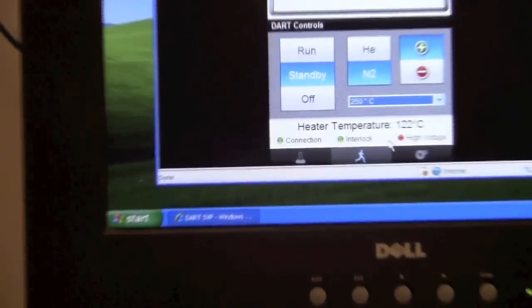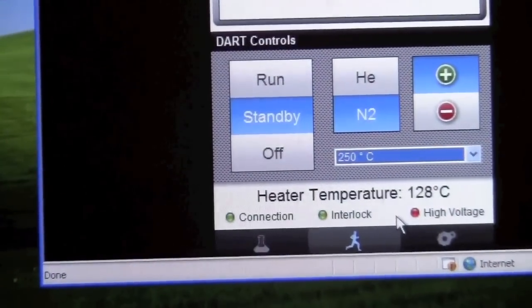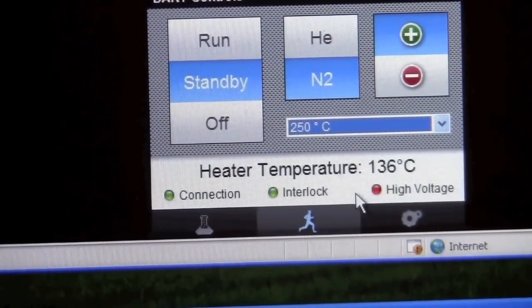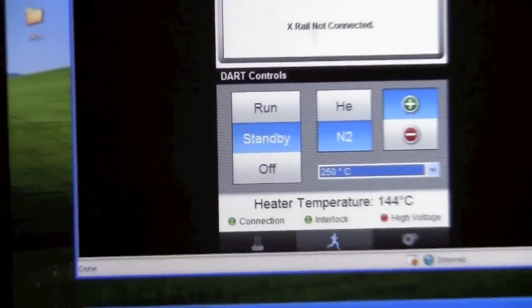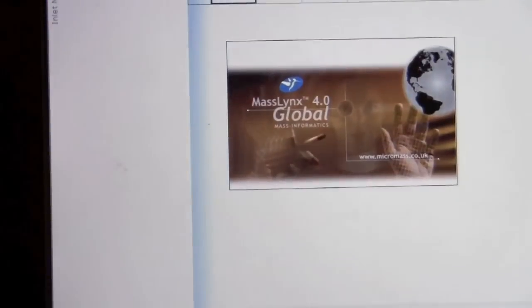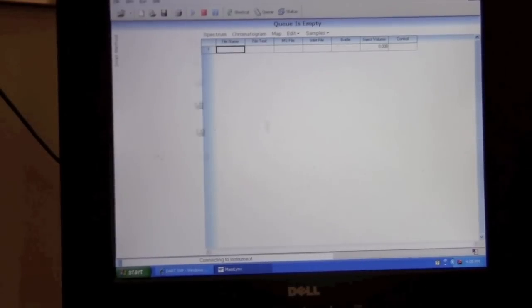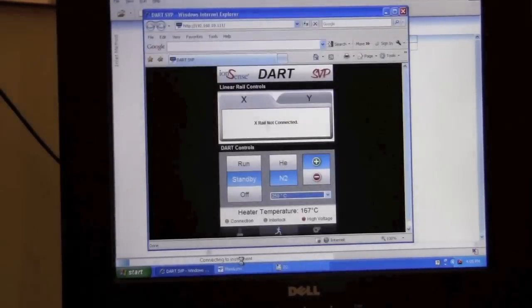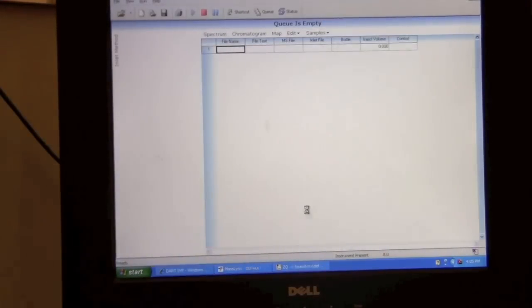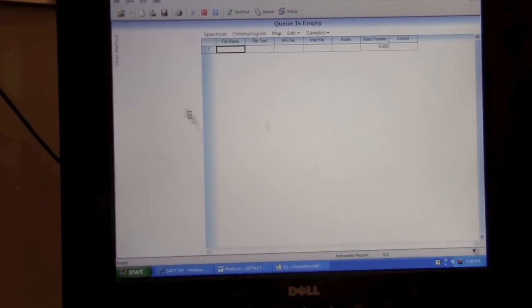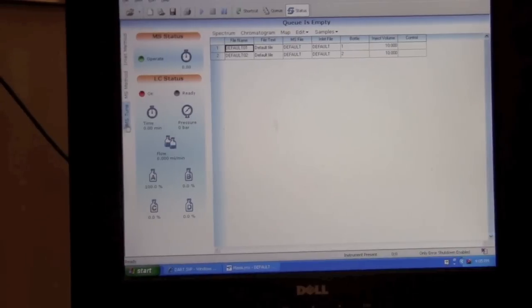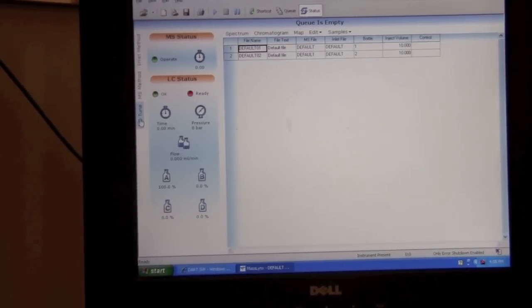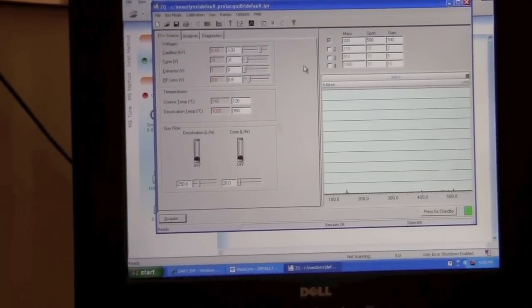As the temperature is ramping up we can start up the mass spectrometer software. To start that we click on mass links. Once the mass links main page has started it will say connecting to instrument, and if everything is correct it will say instrument present. After the page has finally opened we should be able to get to MS Tune. So click on the MS Tune link. That will bring up this page.